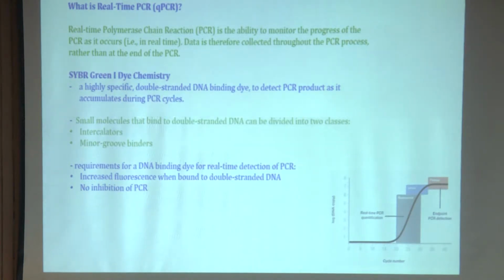So we have to bring it to the electrophoretic unit, and then you are able to deduce whether products are amplified, whether templates are amplified, whether we have amplicons in our reaction. So here we are able to monitor the progress of the PCR itself, as it occurs.